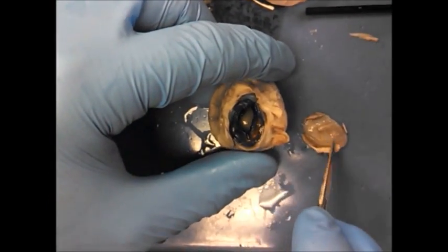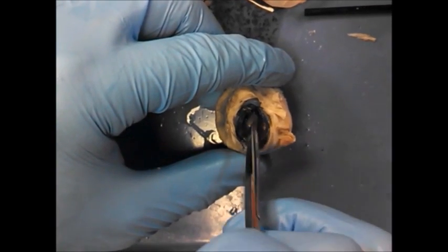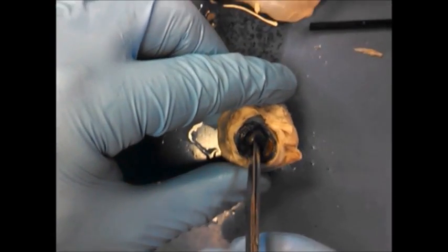You see the cornea like that on the test. The iris is the colored part of the eye, and then the hole is the pupil, and what you see back there in the back is the lens.